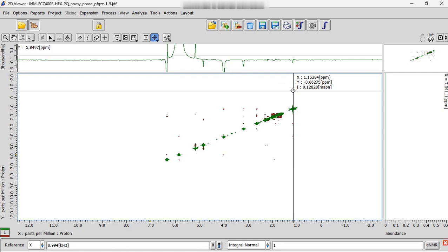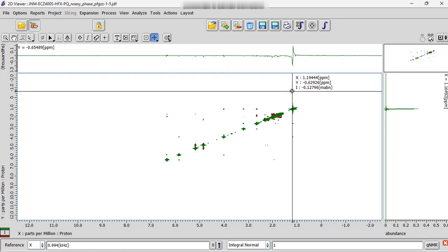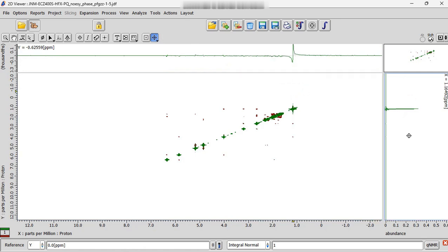the spectra. Now in this case, I'm selecting this peak, which this vertical line should touch. Now if you click on that, now on the Y scale, you can see the slice of the particular peak of the 2D spectra. Now again you can zoom the base so that any errors in the base can be visible very clearly.